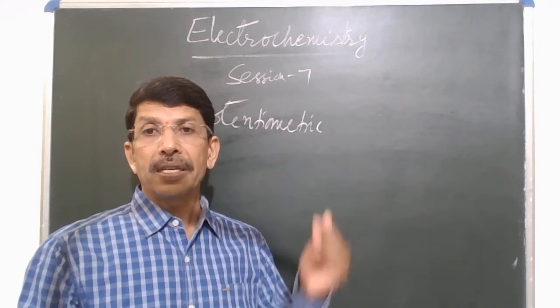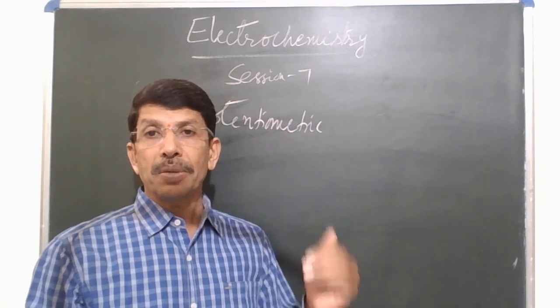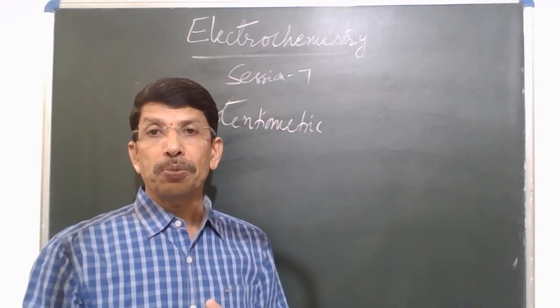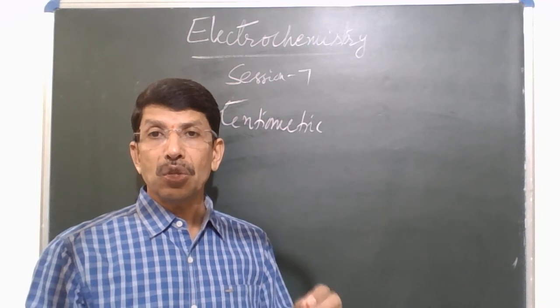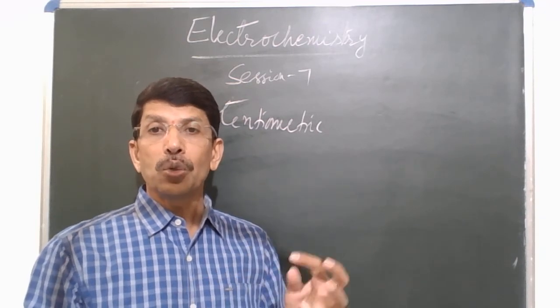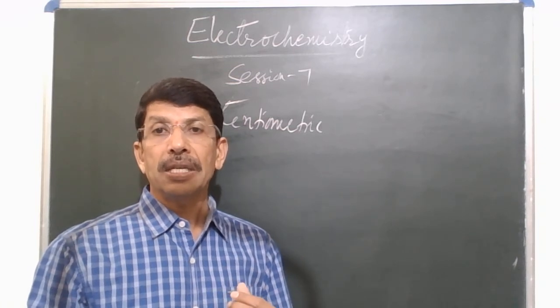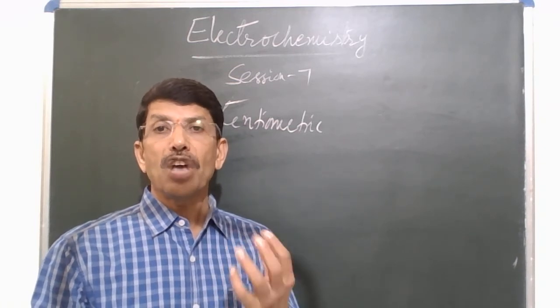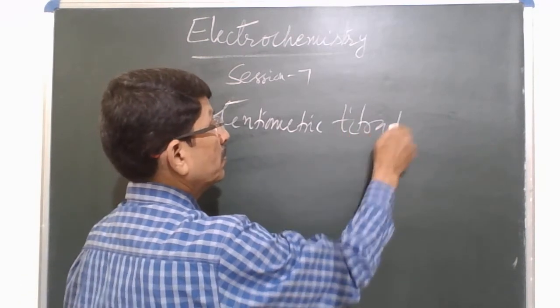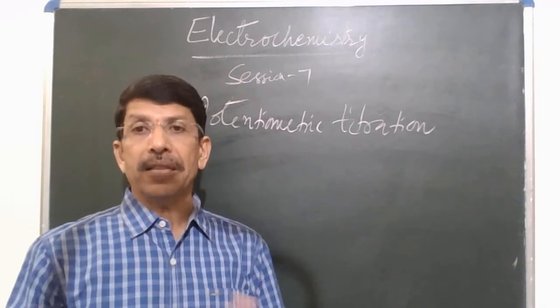During a normal titration, in the presence of an indicator, you add the titrant till there is a permanent color change in the solution. Once you observe the color change, you stop the addition of titrant, and noting down the volume of titrant, you calculate the amount of the given substance in the solution. That's a normal titration. We can also perform these titrations by instrumental methods.